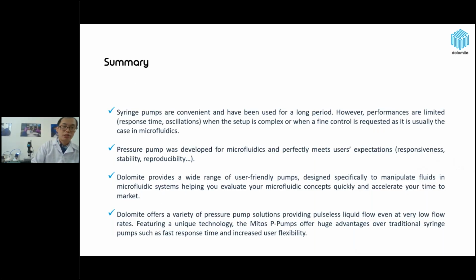Let's summarize today's session. We already know that syringe pumps are very convenient and have been used for a long time. However, their performance is limited, like the response time or oscillations, when the setup is complex and when fine control is required, as is usually the case in microfluidics. The pressure pumps were developed for microfluidics and perfectly meet user expectations, like response, stability and reproducibility.